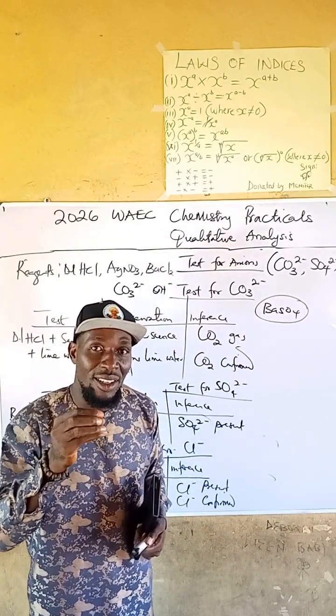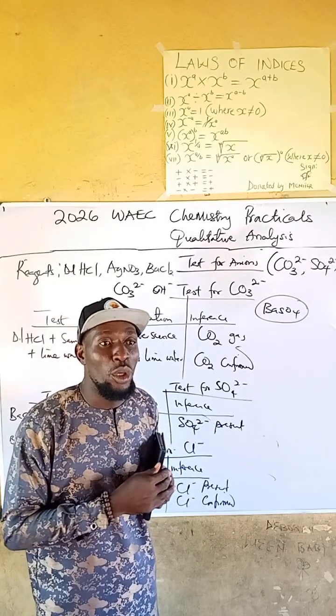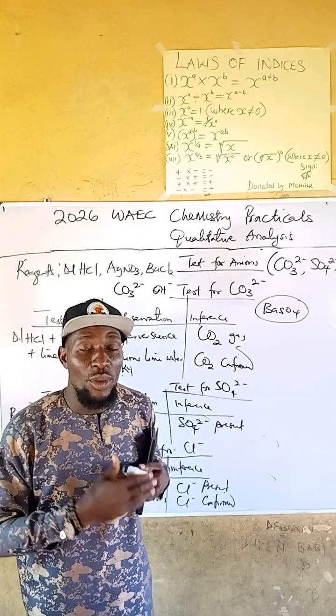The next thing we are going to look at is test for gases. That's what we are going to do. Then we are probably going to do flame test.